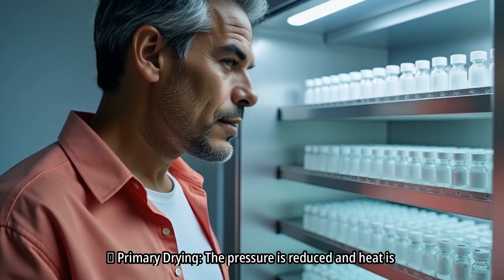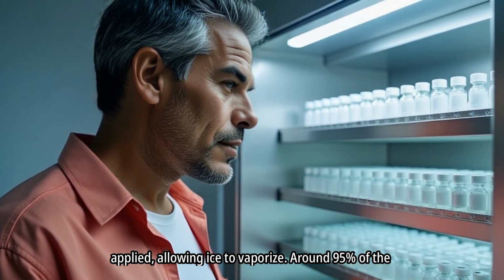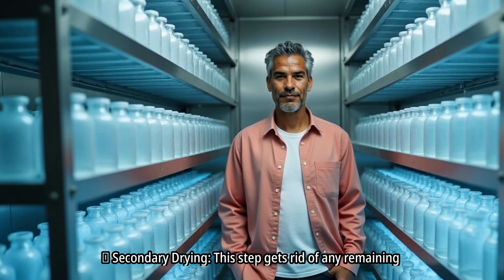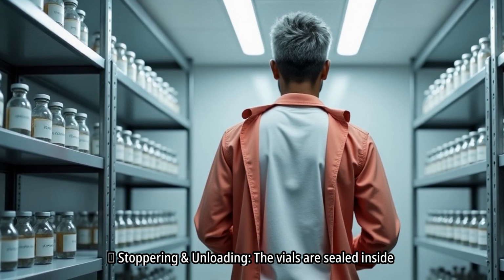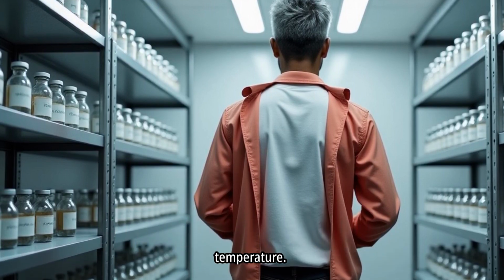Primary drying. The pressure is reduced and heat is applied, allowing ice to vaporize. Around 95% of the moisture is removed at this stage. Secondary drying. This step gets rid of any remaining water molecules. It begins right after the ice has been sublimated. Stoppering and unloading. The vials are sealed inside the chamber and then removed after reaching the unloading temperature.